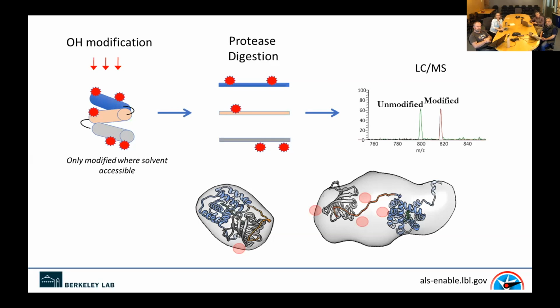And we can do this on a residue by residue level, so you get information about the accessibility of each residue to water, basically.